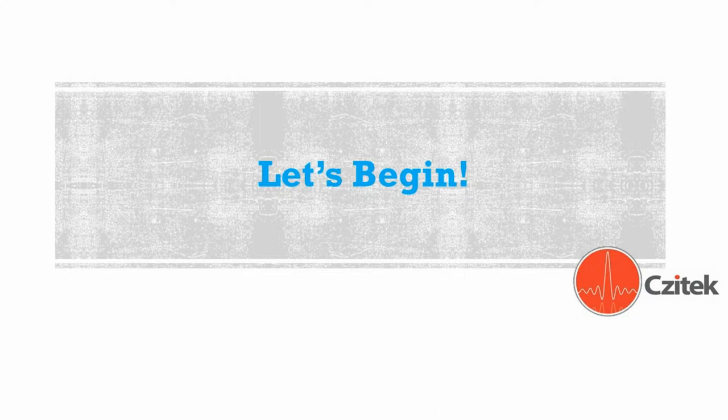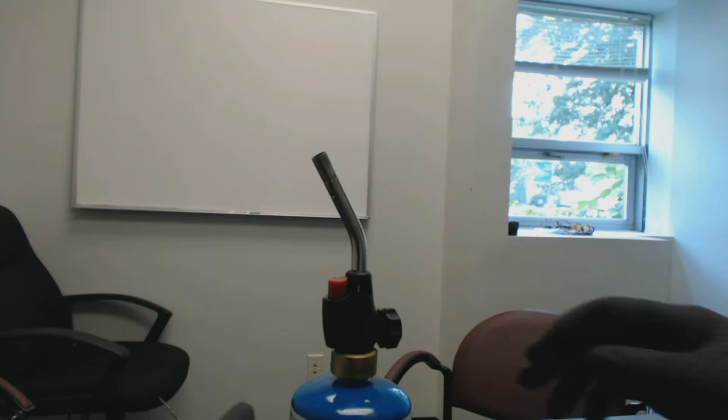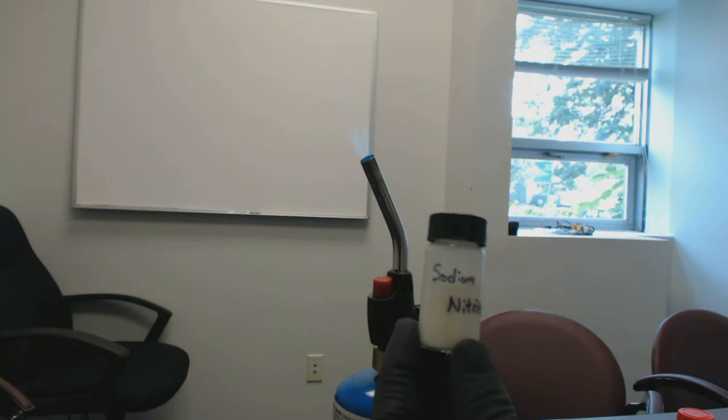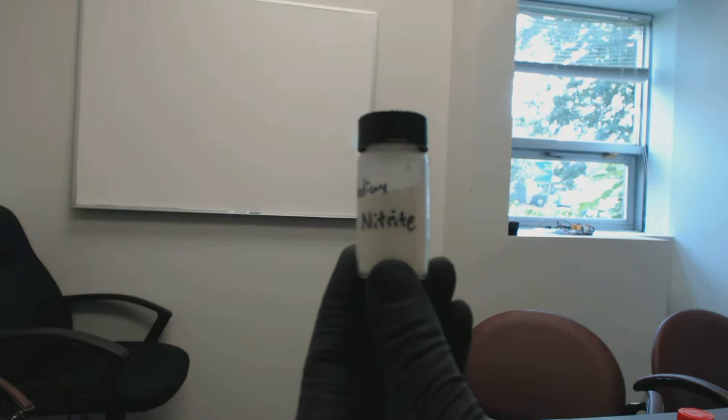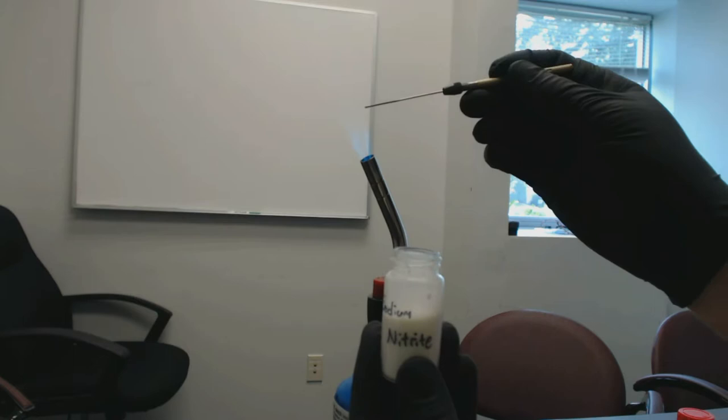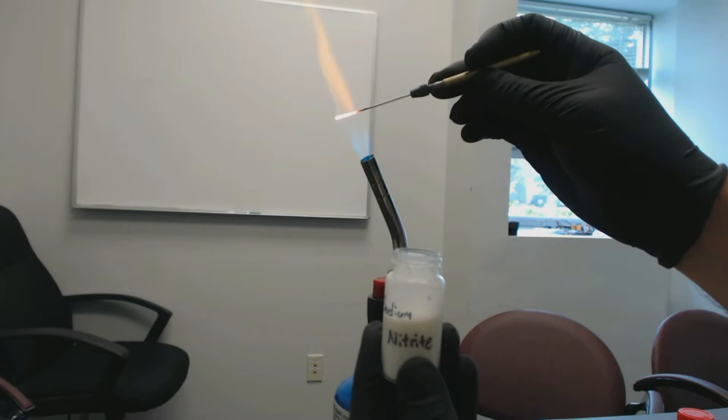So let's begin. We're going to turn on our torch — in this case it's a propane torch. Then we are going to get out our transferred amount of sodium nitrite and remove the top. Here is our tungsten needle held in place in the pin vise, which we are going to slowly heat up with the flame. You can see it's glowing nice and red hot, and I am uniformly heating it by rolling the needle in the flame.